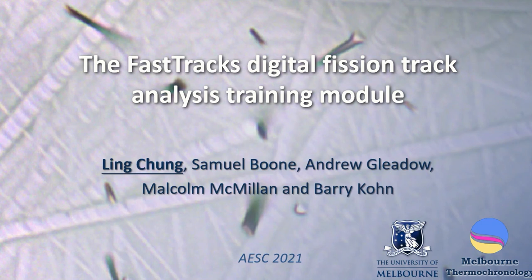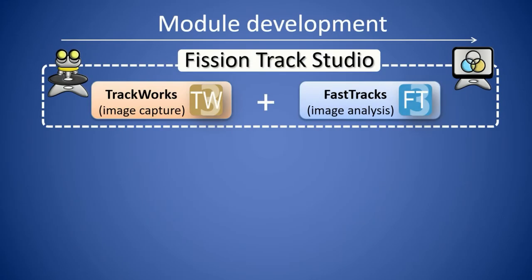Hello everyone. It's a great pleasure to have this chance to report the development of a digital fission track analysis training module that we've been working on for the past few months during the lockdown. My name is Ling Chung, currently working at the Melbourne Thermochronology Research Group as a research fellow and fission track dating specialist. The module I'm about to introduce is made possible by Fission Track Studio.